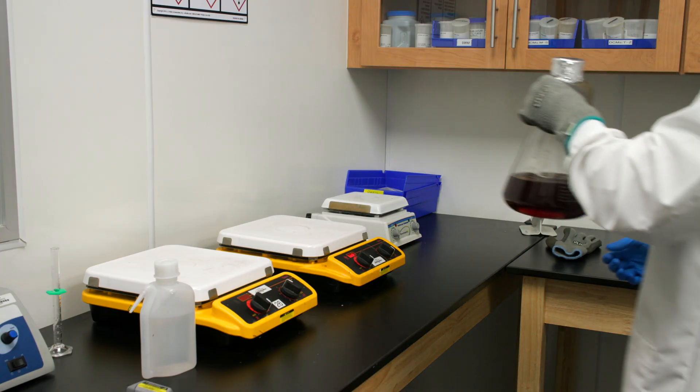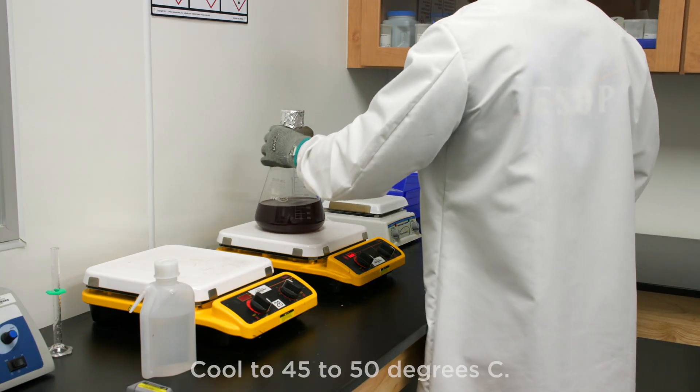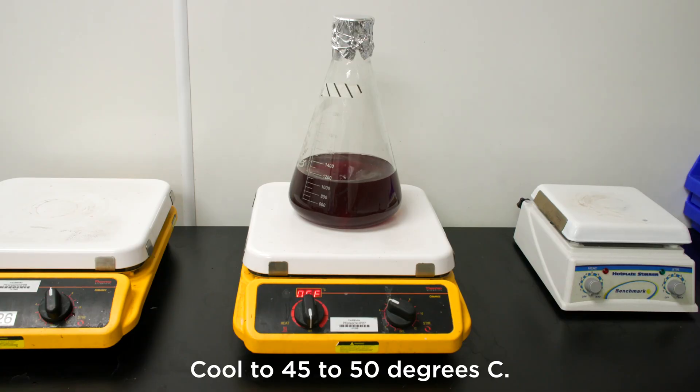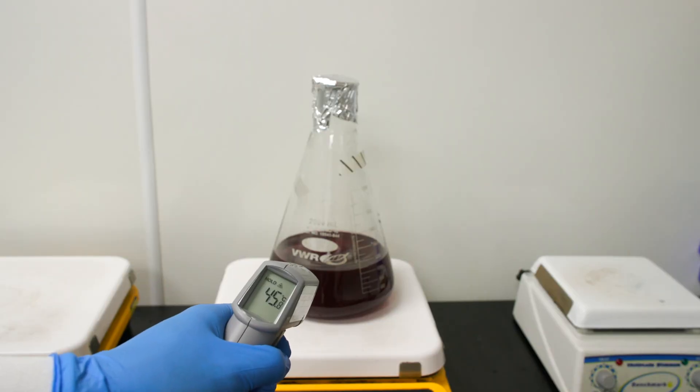Stir mildly while cooling so as to not create bubbles. Cool the media to 45 to 50 degrees Celsius. You can check the temperature with an infrared no-touch thermometer.